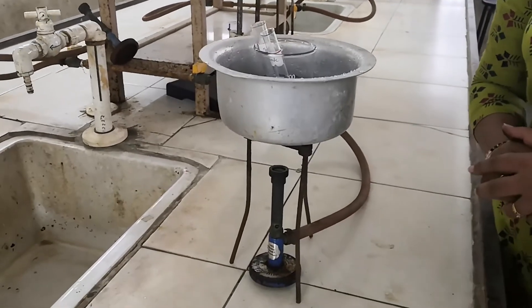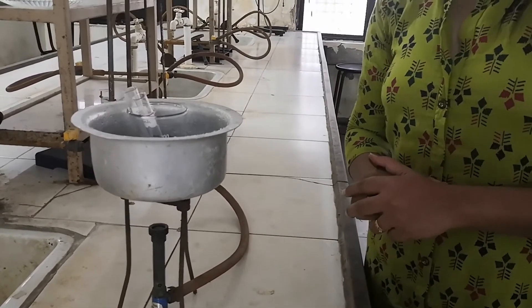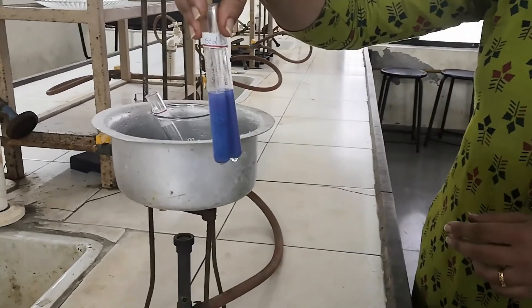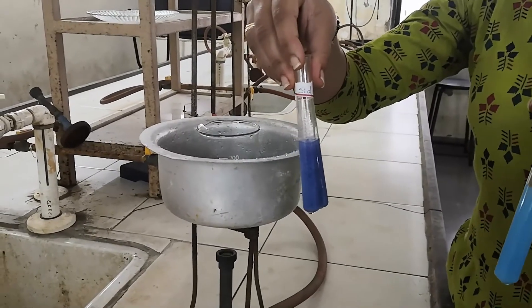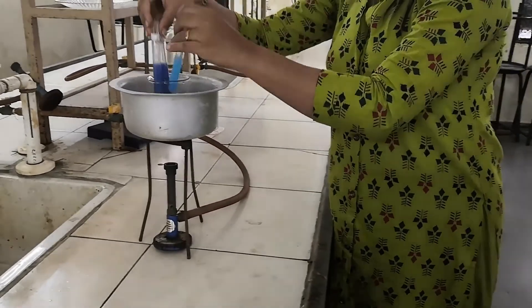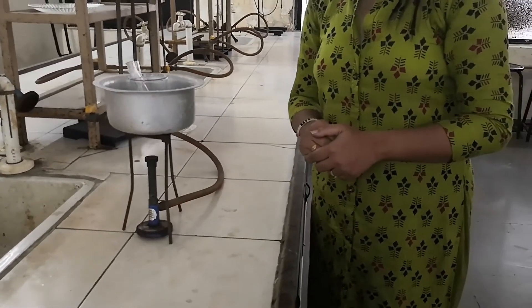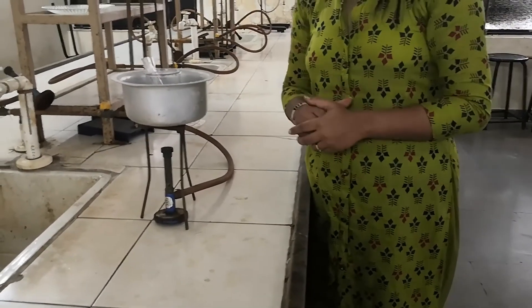After 20 minutes, measure the absorbance at 520 nanometers using a colorimeter. You can see the color of the solution has changed. Initially the Biuret reagent has a blue color, which after reaction with the protein sample gives a purple-violet color. By measuring the intensity of this purple-violet color we can determine the protein concentration in the sample.